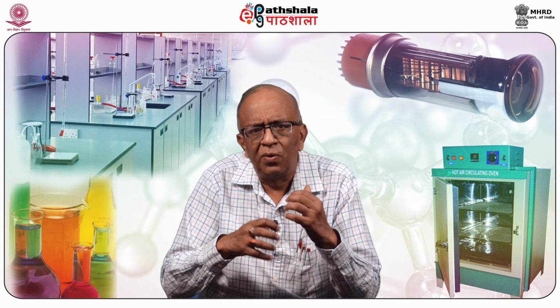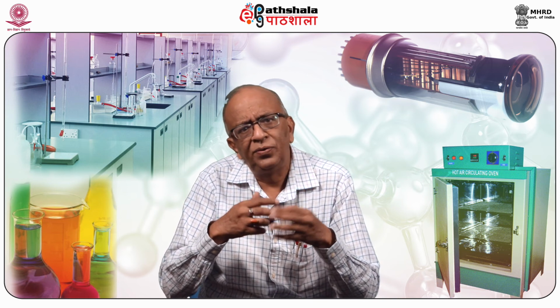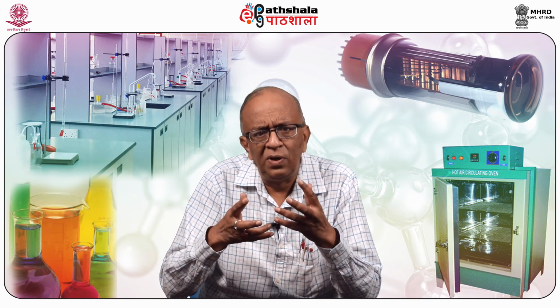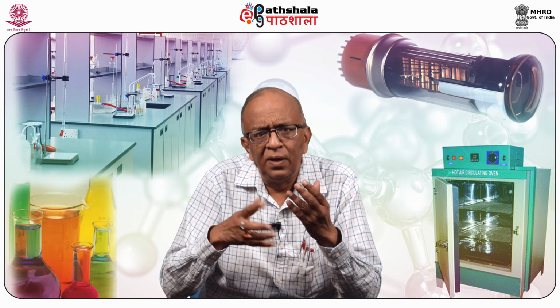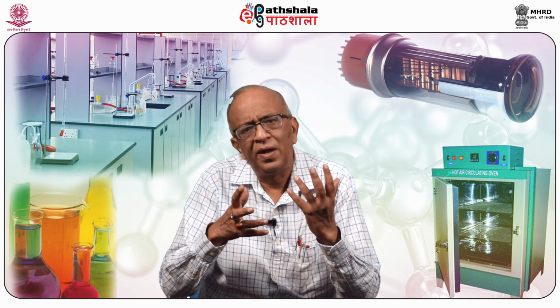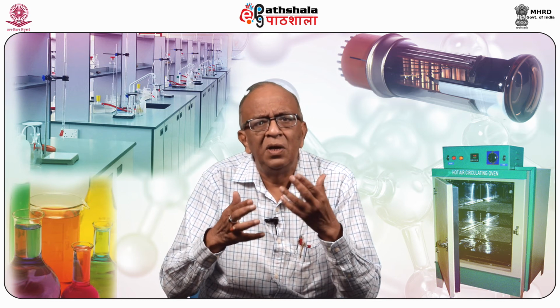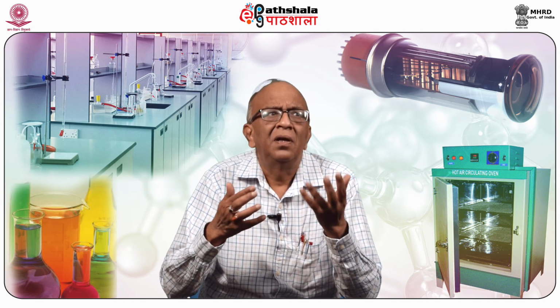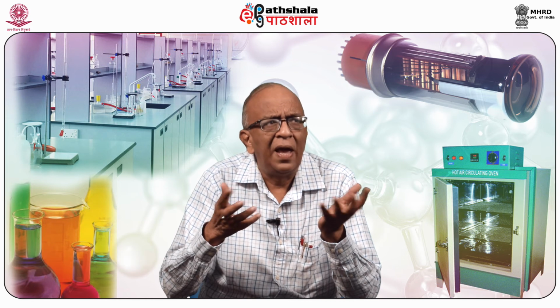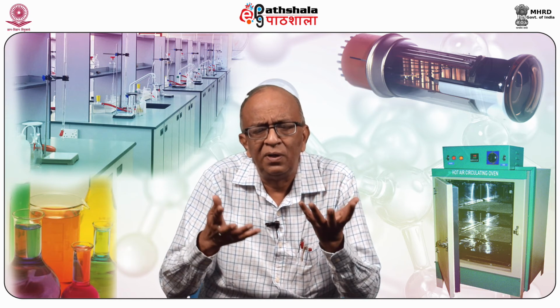Applications of process chromatograph. Most of the applications of process gas chromatographs are in petroleum and petrochemical industries, for the formation of different types of products which are analyzed at every time of the product formation. It has been noted that in a single petrochemical industry, at one point, over 60 chromatographs have been used.